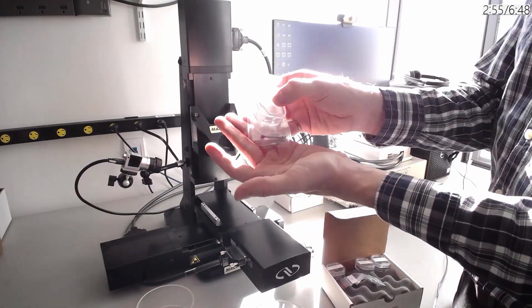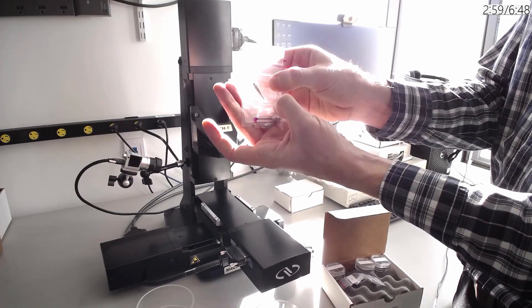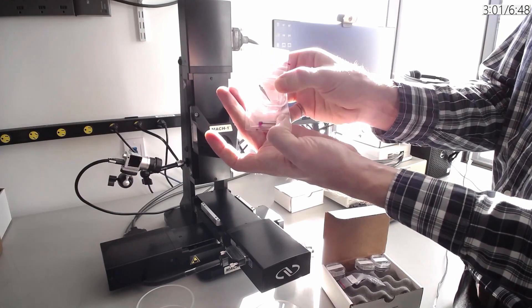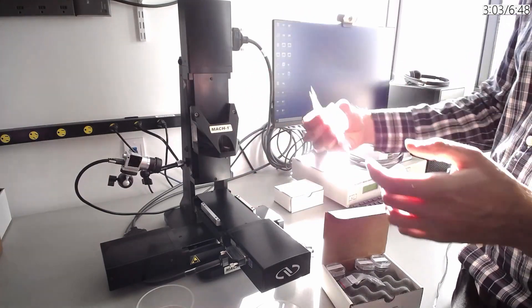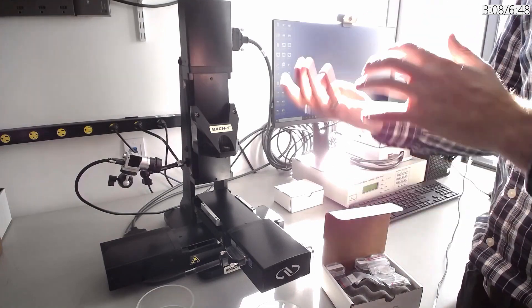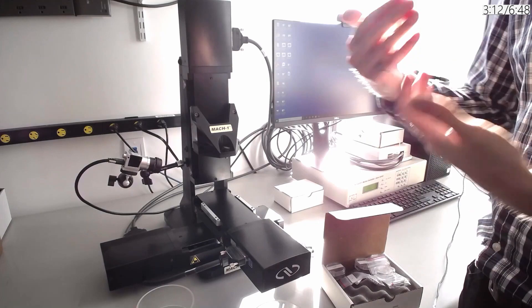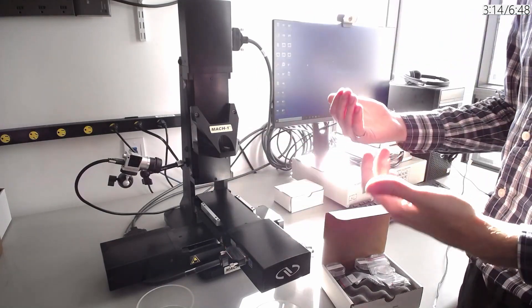We also have a wide variety of spherical and flattened indentors — for example, this one is 0.3 millimeters to 5 millimeters. Having a wide range of these allows you to test both the surface properties and the bulk properties of the sample, or to increase or decrease the diameter to increase or decrease the load registered depending on the load cell you're using.